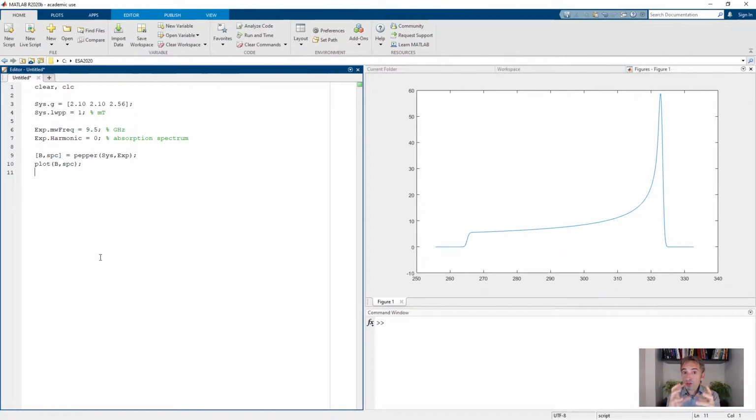And these small structural changes, of course, have electronic effects, and they will slightly perturb your G tensor. So from molecule to molecule, the G tensor will have slightly different values. Or, as we say, the G tensor has a strain, or it's distributed. And EasySpin can include this type of broadening very easily. And if the G tensor is not a uniquely defined number, but a distribution, it will broaden your spectrum.